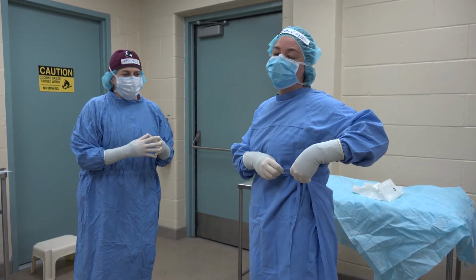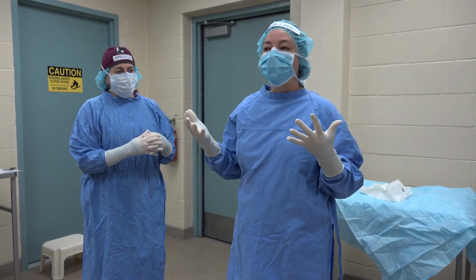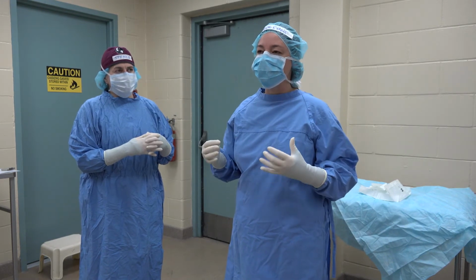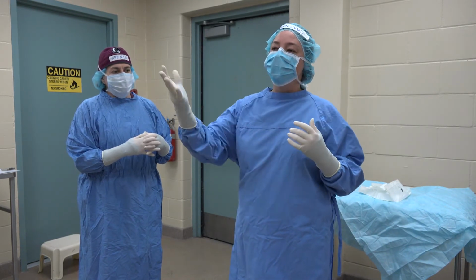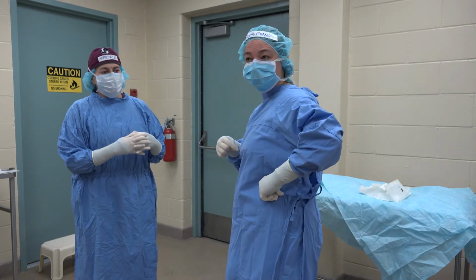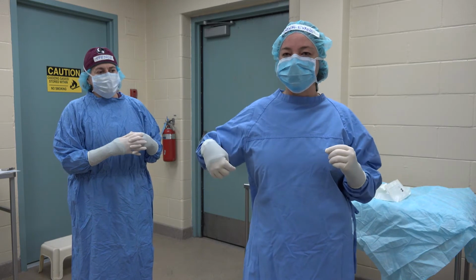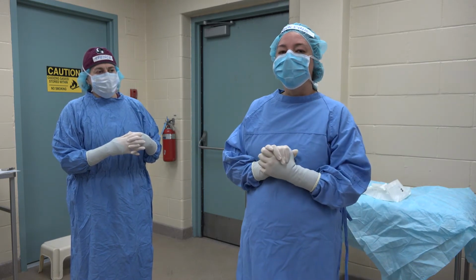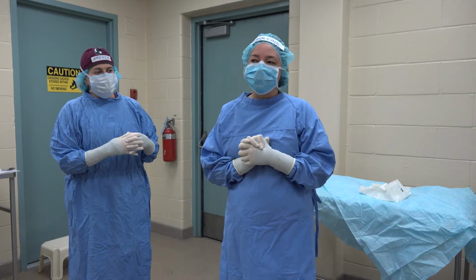Now, what happens if you accidentally drop it? If you accidentally drop it or it came untied while you were gowning or any of those kinds of things, no big deal. Then your unsterile friend can tie it in the back, but they tie it in the back, not on the side. They tie it straight in the back, and then your back is just not aseptic. Okay? All right, now we're going to move on to draping.